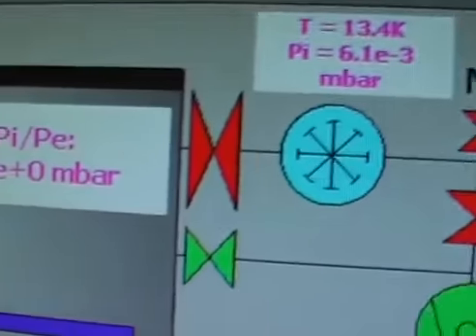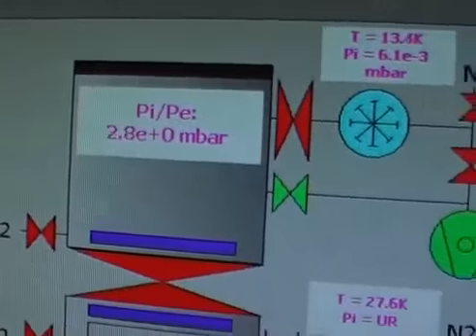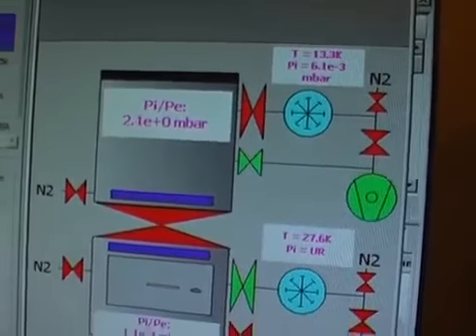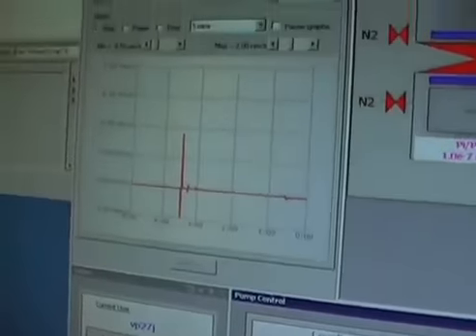In the meanwhile, I can keep on selecting the process. Like we said before, we clicked on Run Processes, then on Browse, and now we're selecting a recipe.